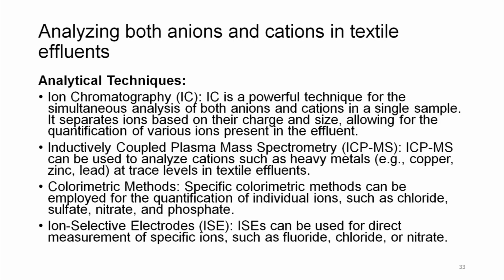ICP-MS is a very sensitive instrument which can analyze quantities even present in trace amounts, such as at the ppm and ppb level, parts per million or parts per billion.